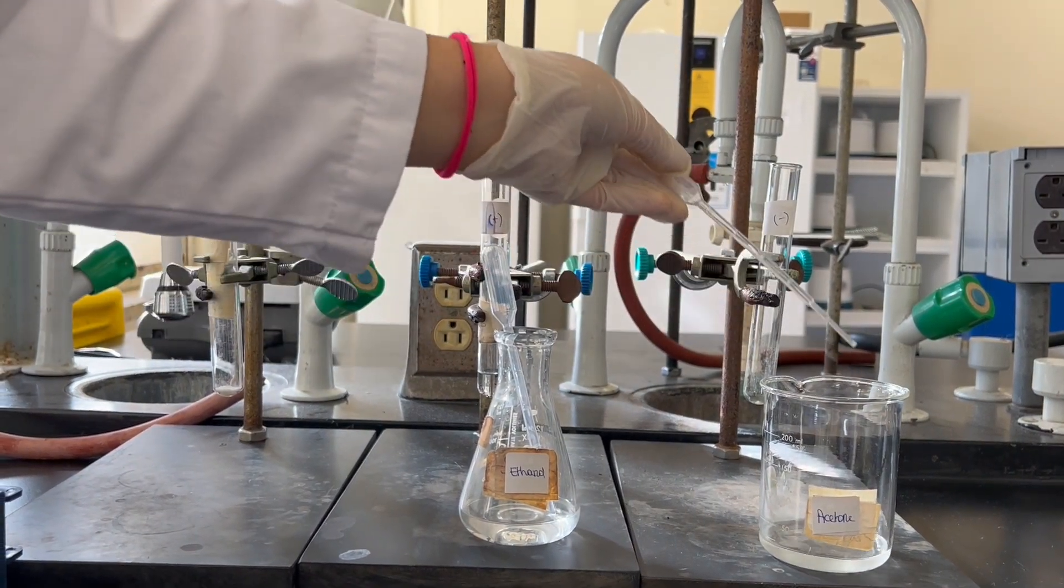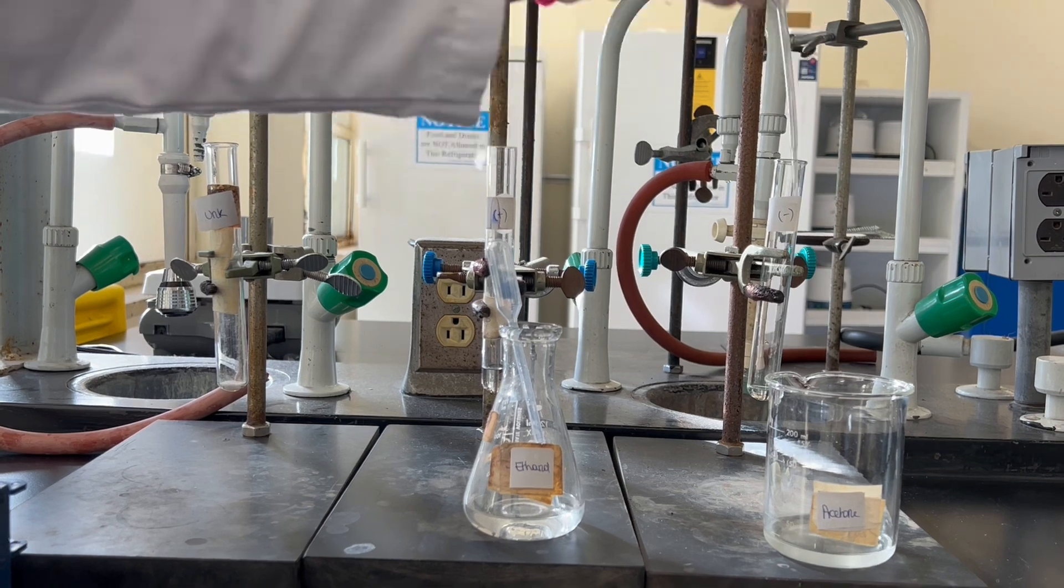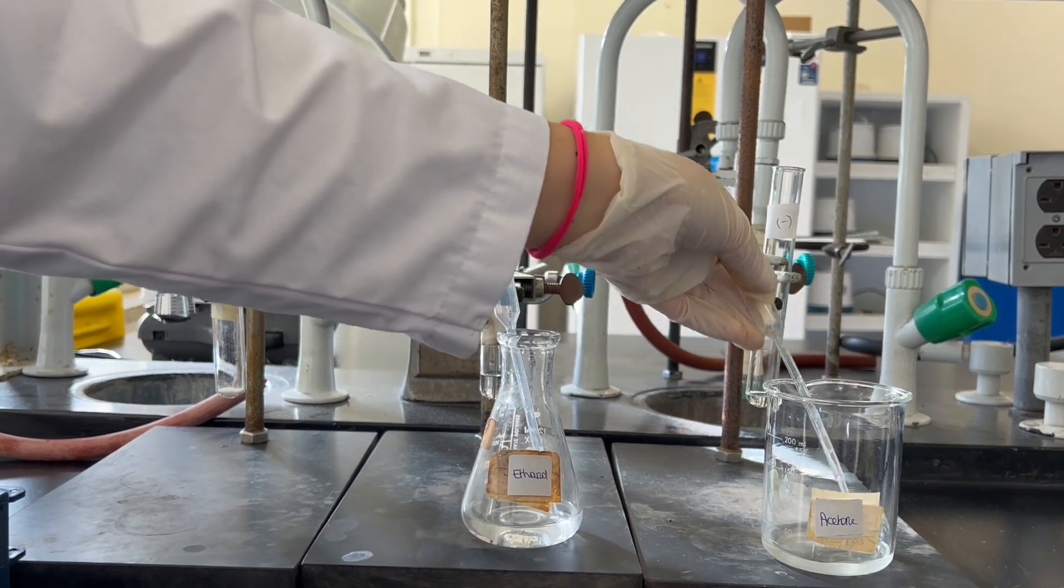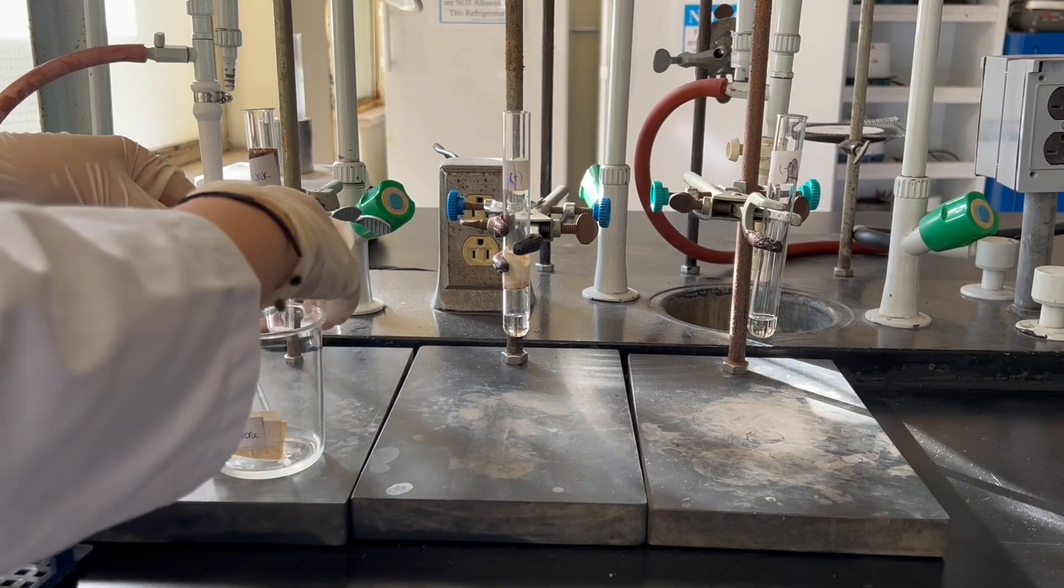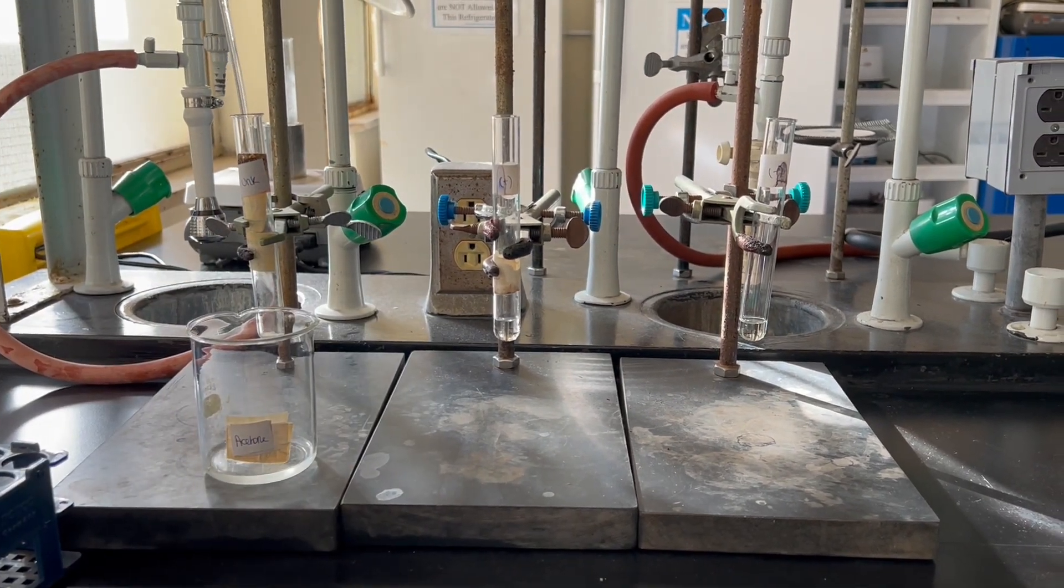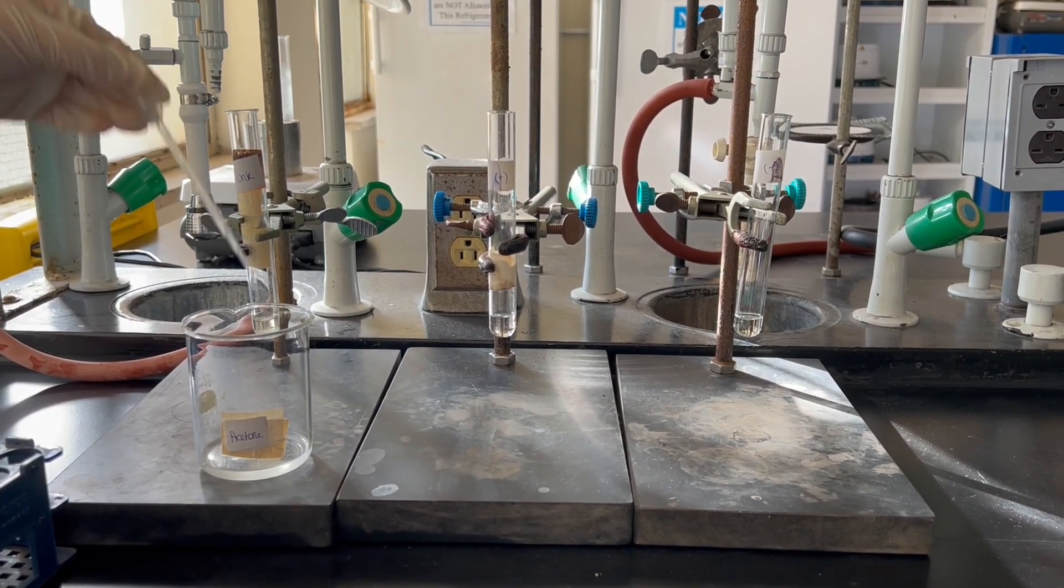Acetone will be used as a negative control since it is a ketone and gives a negative test. Since our unknown is a solid, we need to add a few milliliters of acetone to dissolve it.